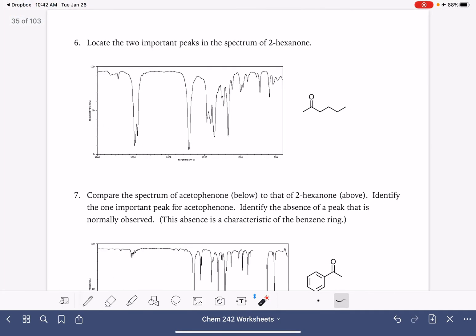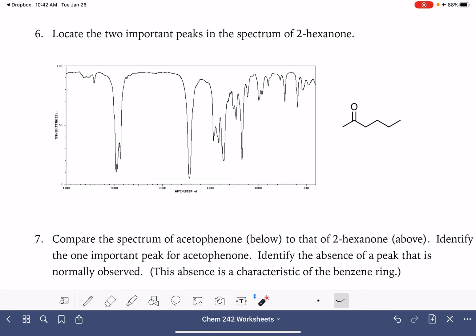And next we have hexanone, a ketone. Let's mark off our spectrum. We're looking for two peaks this time. Of course, the carbon hydrogen peaks. And then here is our carbon oxygen double bond. Always very strong and broad. Not hugely broad, but not sharp and pointy and spiky.